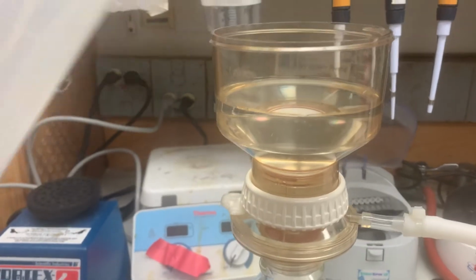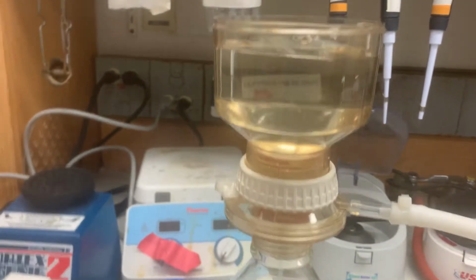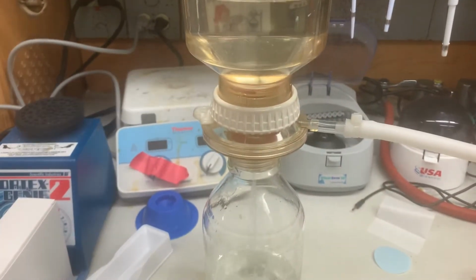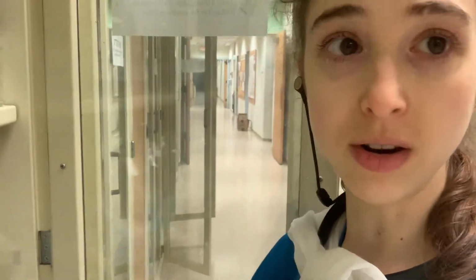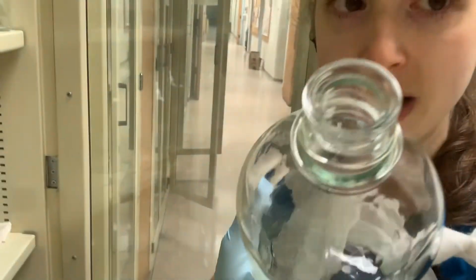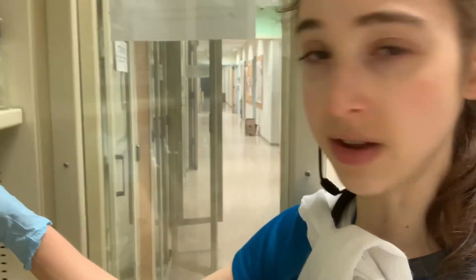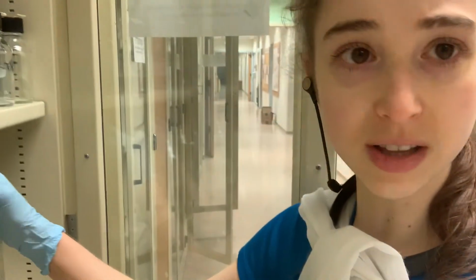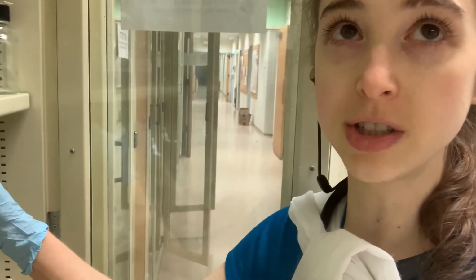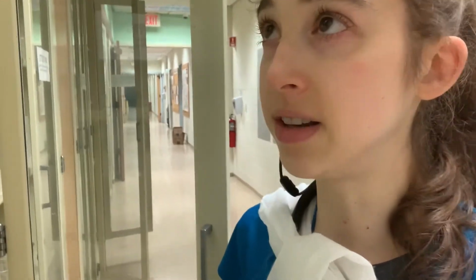So these things only hold like 500 mils, so if I want to make a liter, I have to fill it part-wise. Vacuum filters aren't compatible with all volumetric flasks, so these have a narrower head, so they're not going to match. But they work with all the various sizes of those other Pyrex bottles with those big orange caps. So just make sure that you know that before you try to use it.